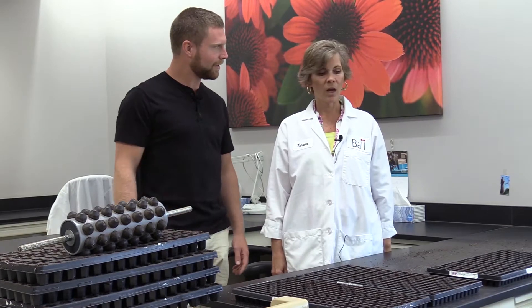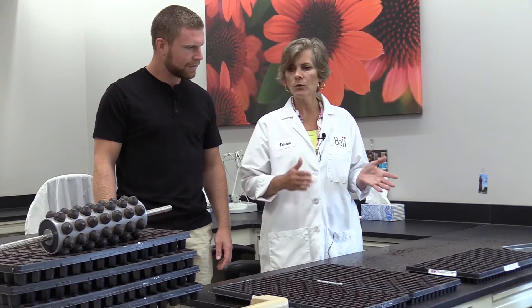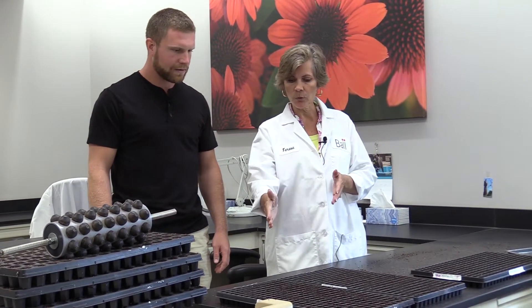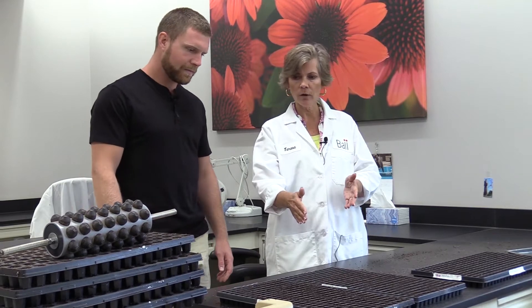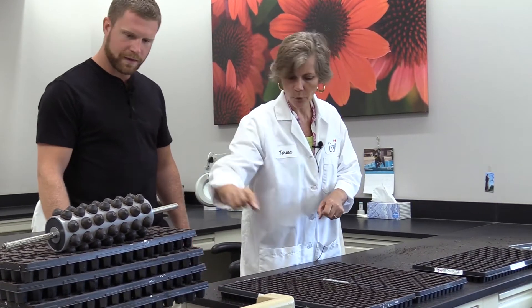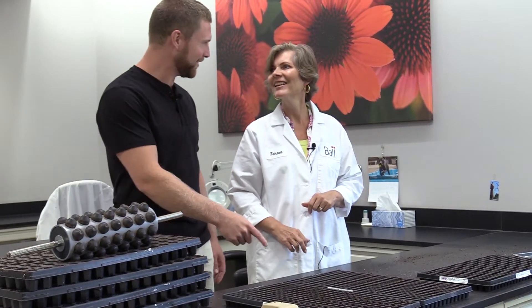What are we looking at here, Teresa? We're doing a germination test. This is a plug flat, so when we do germination tests we want to make it very relevant to a grower, so we're using a commercial flat and commercial soil. We do what we call a dibble — we run a little bar over here to make the center. This is a really neat one. I do notice the tray.